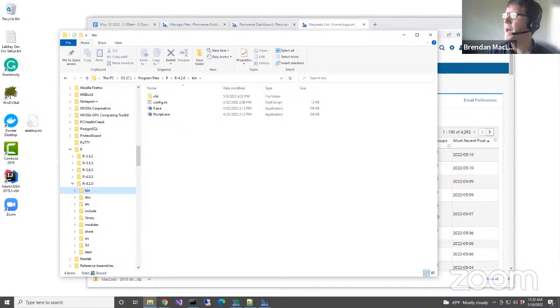Issue to install our package despite having 4.3 on RStudio, just got an error message. Any trick? So this one I answered. So there's somebody saying, hey, I have R 4.0.3 on RStudio, and I just got an error message trying to install.